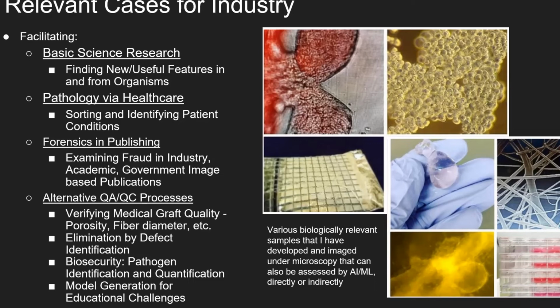to make models or to make images for educational purposes. I can imagine a lot of teachers enjoying that. To the right, there are various biologically relevant samples that I've developed, like 3D culture, 2D culture, various fibrous meshes, and more, where the work can be indirectly enhanced by AI/ML depending on how you apply it once you image the biological samples.